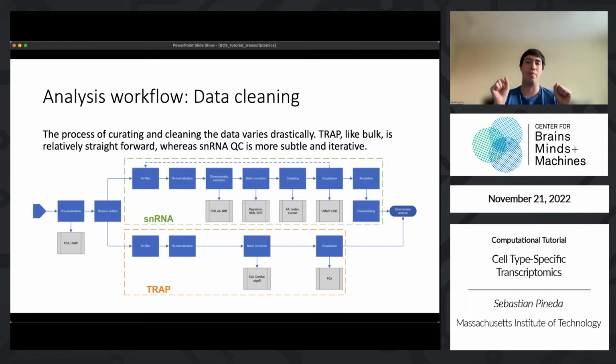Cells that, because I should say, when you sequence these cells, they're not necessarily cells. You sequence droplets, and every droplet has a bead with some DNA, right? And you sequence all of those, and most of them will be empty. The capture efficiency is very low. It's about 1%, less than 1%. Less than 1% of your droplets would actually have cells or nuclei in them. And this is by design, because you would rather have no nuclei in a droplet than more than one.